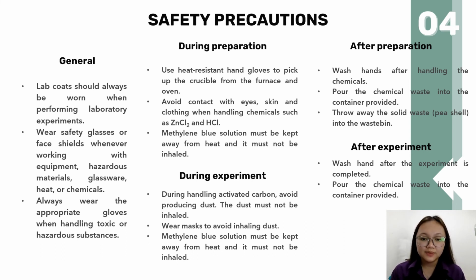Next, during the adsorption experiment, when handling the activated carbon, avoid producing dust. If dust is produced, it must not be inhaled. Therefore, to avoid inhaling the dust, we must wear a mask. Similar to the safety precautions during preparation of methylene blue solution, the dye solution must be kept away from heat because it is a flammable liquid and it must not be inhaled. And last but not least, after the experiment, we must wash our hands and the chemical waste produced must be poured into the container provided.